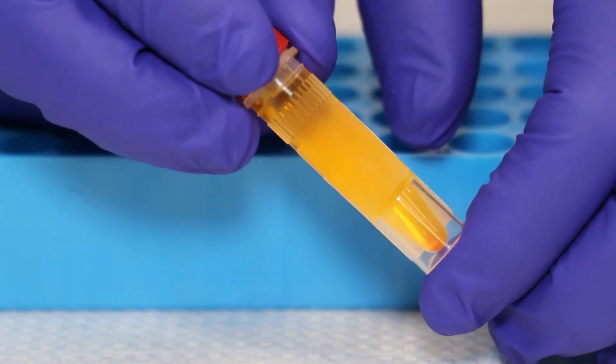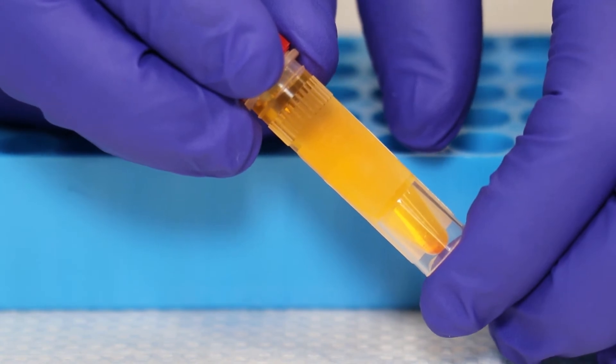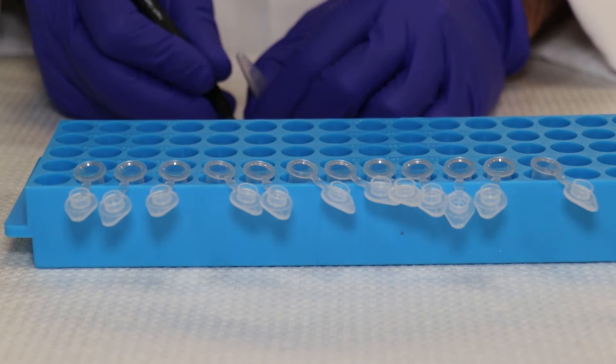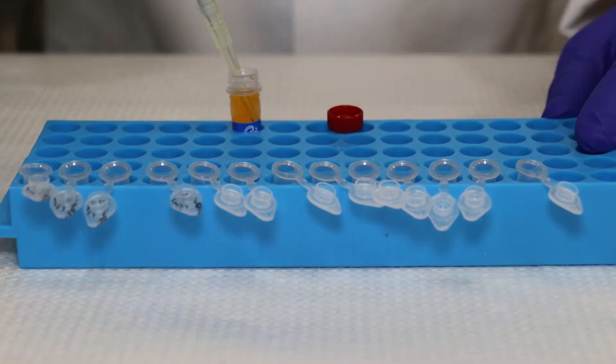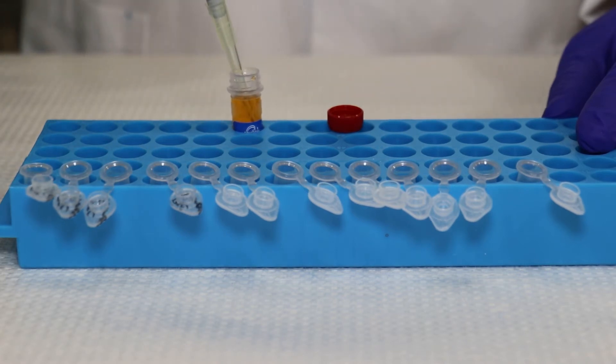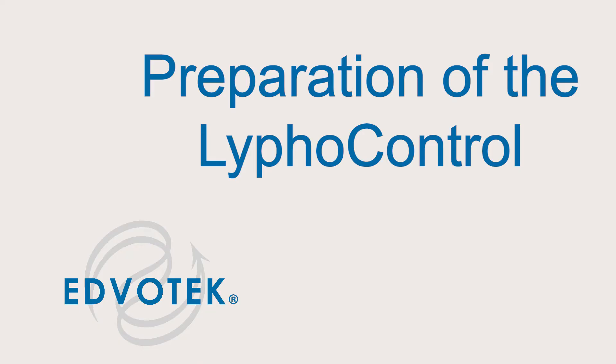The solution should be light orange and clear of any solid pieces. Step 4: label 13 microcentrifuge tubes PTC primer. Aliquot 90 microliters of the rehydrated primer into the 13 tubes. Place the tubes on ice until they are needed. If you would like to prepare the primers ahead of time, they can be aliquoted and frozen until needed.